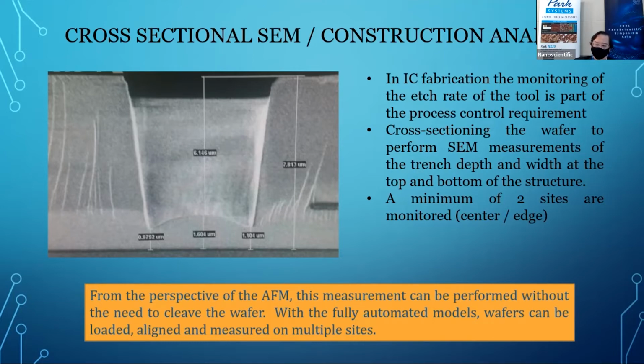And if you were to take the total time, although people would make comments like, if you use the AFM, it's a much slower process and you scan through the surface, in reality, if you think of it, the time taken to cut and prepare the sample and look at two sides, because you have to vacuum down the chamber to do the measurements, the AFM is actually comparable in terms of timing.